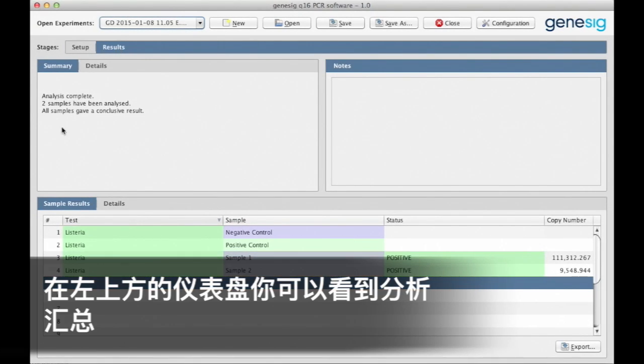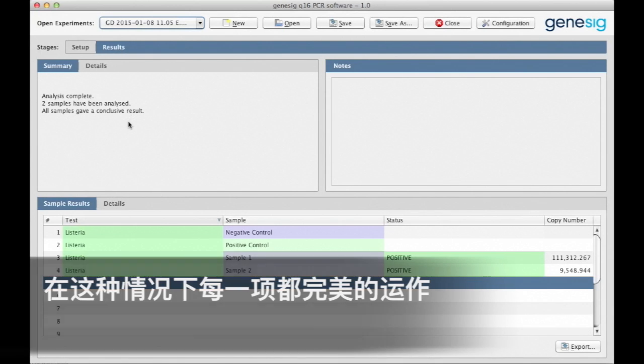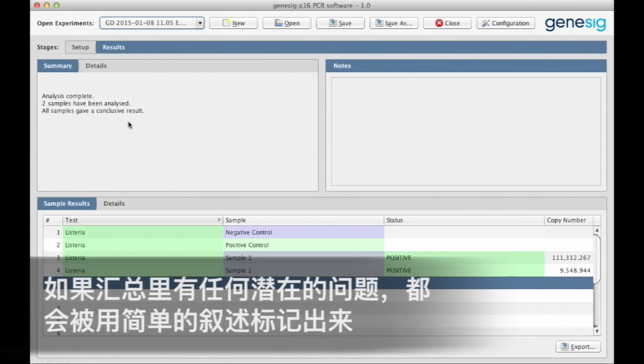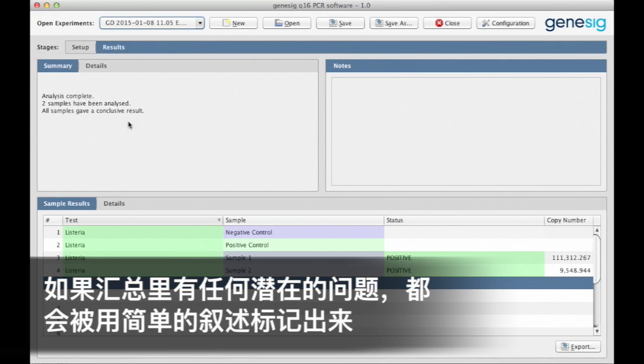In this top left-hand panel, you'll see a summary of the analysis. In this instance, everything has worked perfectly. If there's an underlying problem with the analysis, then that will be highlighted up here for you in simple English.